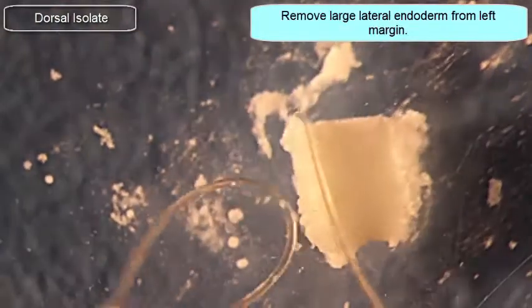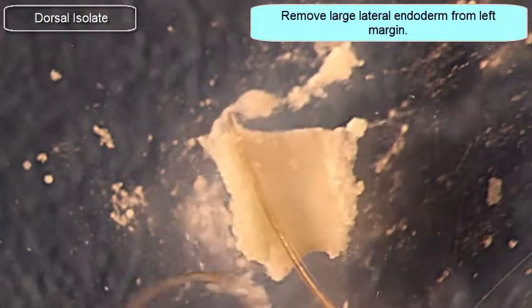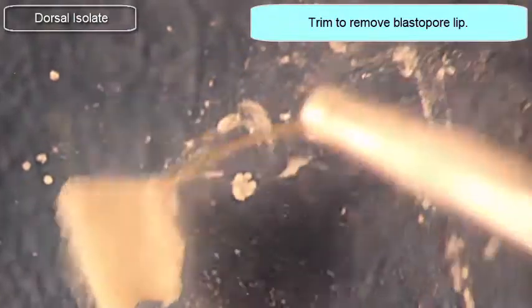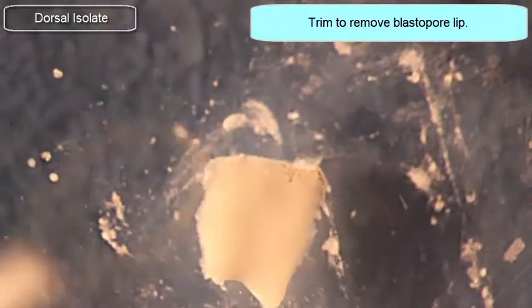I'll trim them from the left and right sides, and then also trim the anterior. I'll flip this around, clean it up a little bit, make a couple more cuts on either side, and then reorient it so that the blastopore lip is on the bottom. I'll make one more cut right there to remove the blastopore lip. Now I have a nice rectangular dorsal isolate.